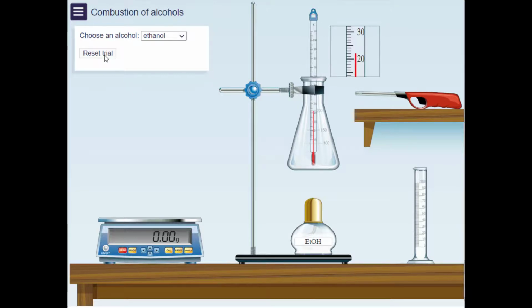In this interactive screen experiment, you do not need to worry about other variables, such as the volume of the water added to the conical flask and the distance between the wick and the bottom of the conical flask, because these will remain constant throughout. To ensure laboratory safety and to prevent deviations from the protocol that could introduce experimental errors, there are a series of built-in alerts that will advise you on how to continue the experiment safely and avoid potential errors.